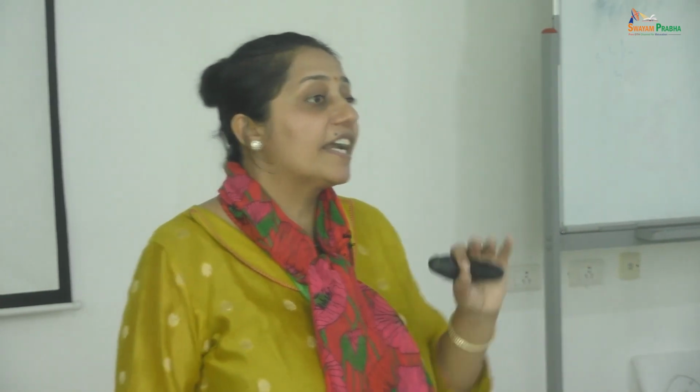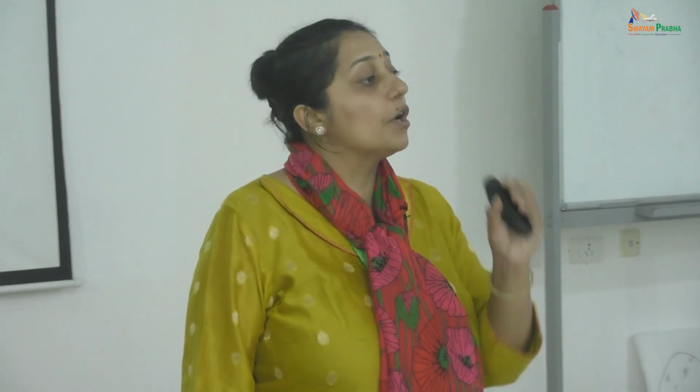So if it is completely non-growth associated, ideally you should be thinking about two-stage cultivation, because ultimately productivity matters. So in the first stage, you should implement all the strategies which can improve your biomass, and then switch to conditions which will improve your product inside the biomass.